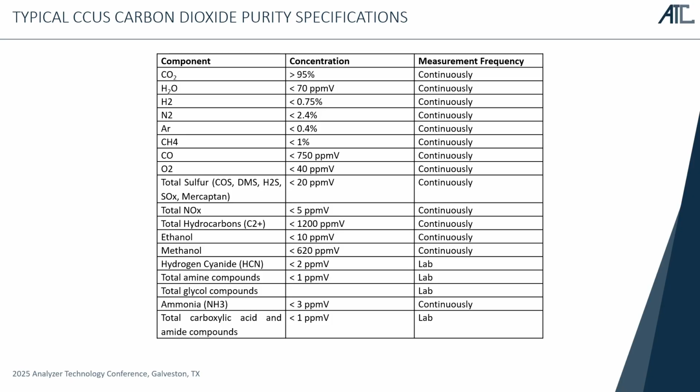But then within the ppm constituents, you get a mixture of sulfurs, especially if this is coming from a combustion process, coming from a stack. You get hydrocarbons, alcohols, the glycol that I mentioned, and various amines that are used as the stripper components. So typically those are what we see. We've had some situations where people ask for some acids as well, like HCl, trace level.